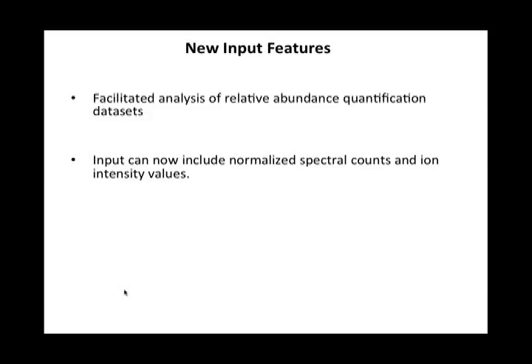So we facilitated this process by automating it and allowing the user to select an option so that everything is done concurrently, and he doesn't have to do that extra manipulation. So we think, again, that we're catering to the needs of our users by doing so and making PSEA-Quant a little bit easier to use for them.